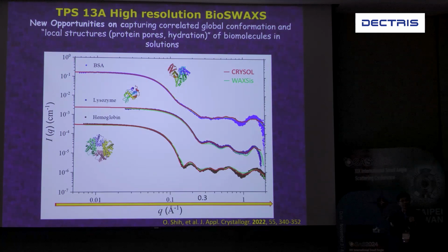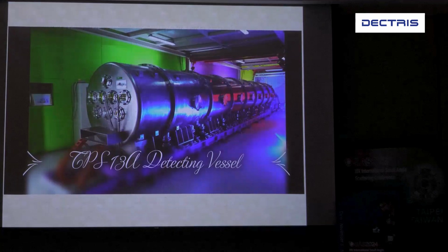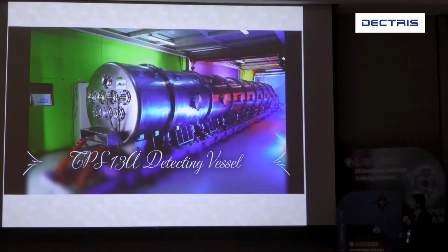So with the detector in air and in vacuum, we get this kind of quality of data. Now we have two detectors working together and get this set of data in one measurement. This allows us to combine all the global structure and also the local structure, including the loops in solution. So now you can see the details with this detector system.